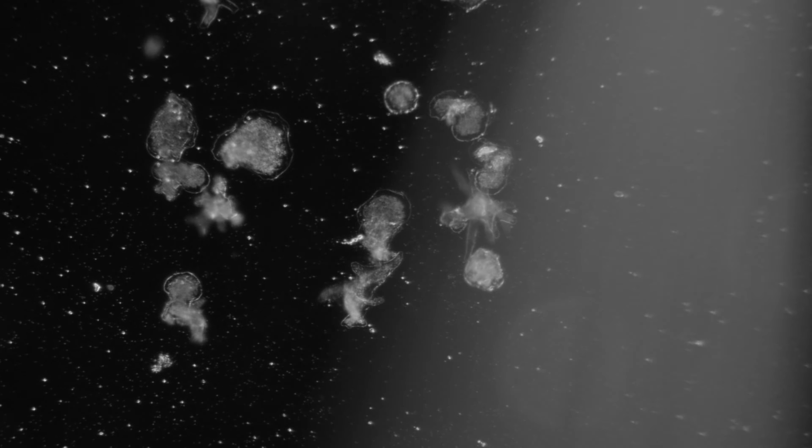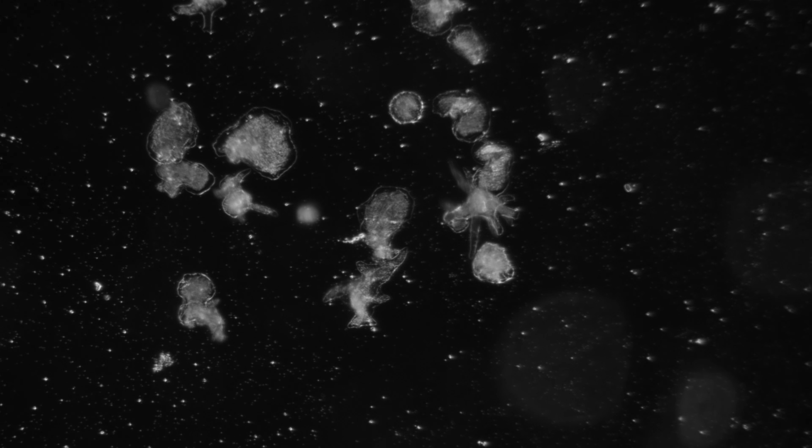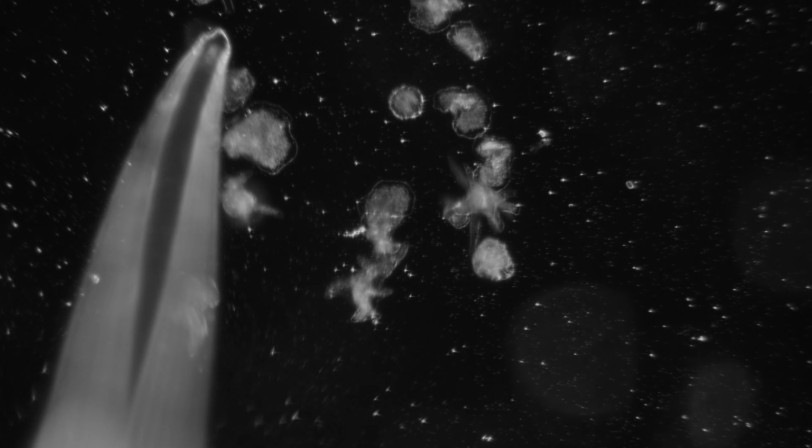We also got this debris. This one, it's a different species. It's more striated, and we also have another one here.